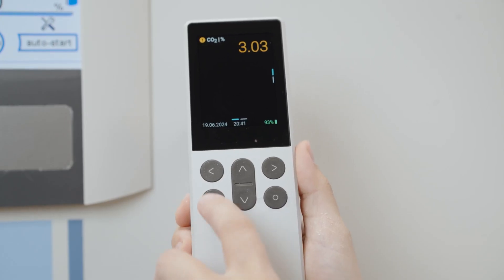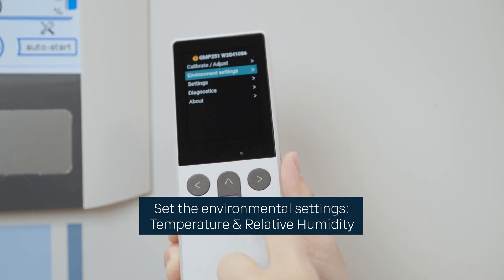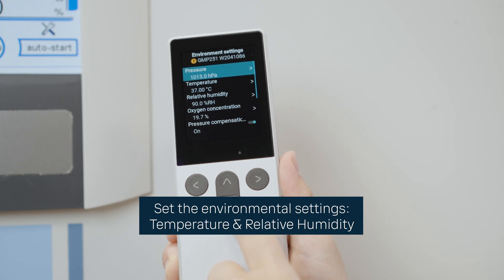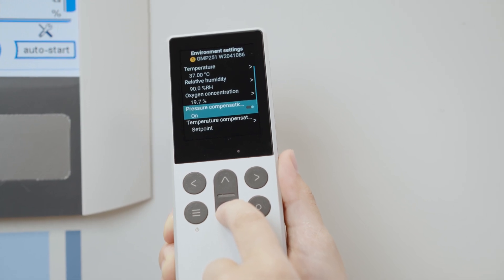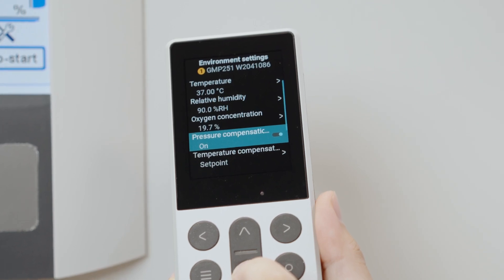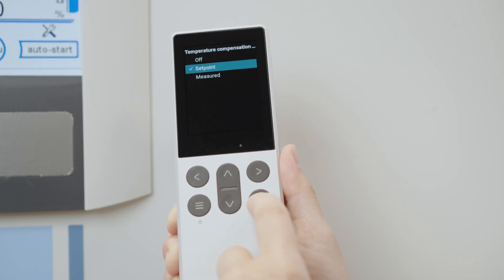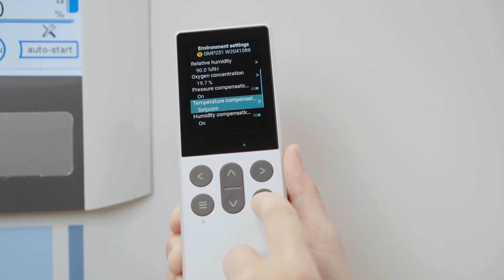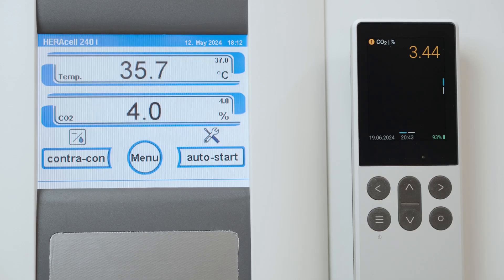Let's set the environmental settings correctly. Temperature and relative humidity should correspond to the incubator temperature and relative humidity. The pressure can also be set if it differs significantly from the default 1013 hPa. Lastly, let's change the temperature compensation mode to set point. Now let's wait for the readings of the handheld device to stabilize. This may take up to 10 minutes.